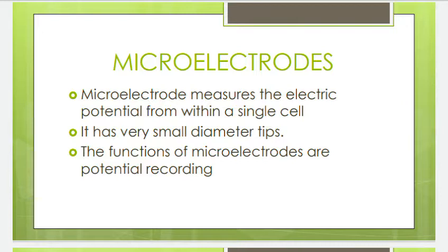So that is the tip. The tip of the electrode is very small, so when we insert this electrode inside the cell, it will not cause any damage to the cell.